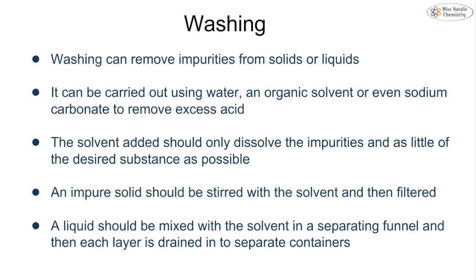Now, washing is very much what it sounds like. It is a way that we can remove impurities from both solids and liquids. The one that you're probably most used to seeing is solids, but we can also wash liquids using this method. So we can carry it out using water, an organic solvent, or even sodium carbonate. It just depends on what organic product you're trying to purify. So if we have excess acid, we would use sodium carbonate to remove that.